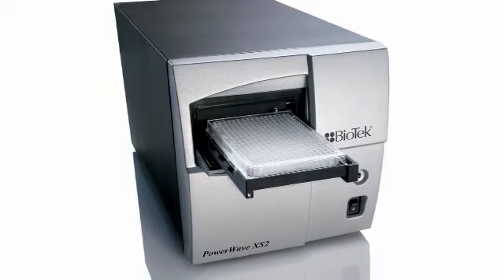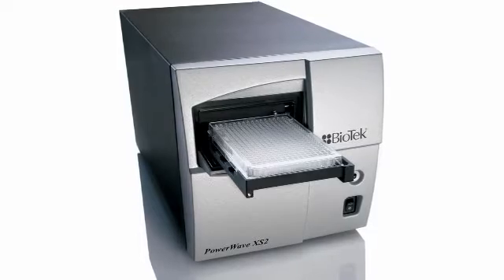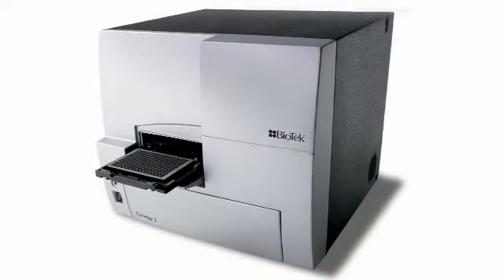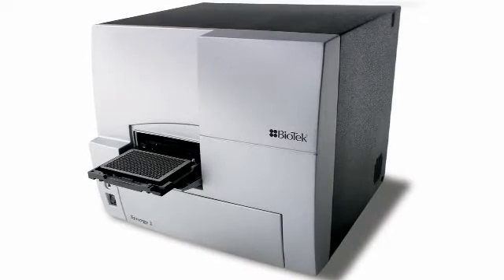The absorbance of the samples in the Take 3 plate can be measured using any Biotech Microplate Spectrophotometer. The fixed path lengths of the plate allow rapid calculation of concentrations based on a standard 1-centimeter path length.